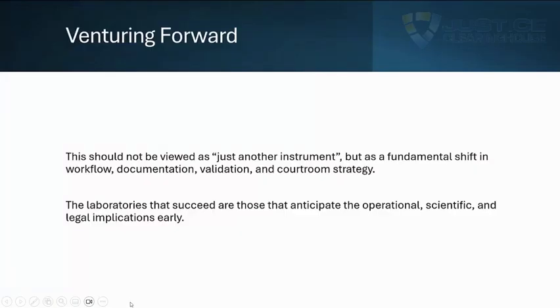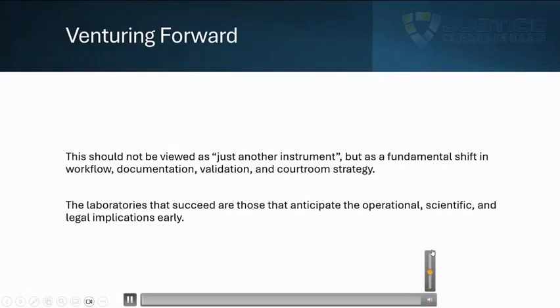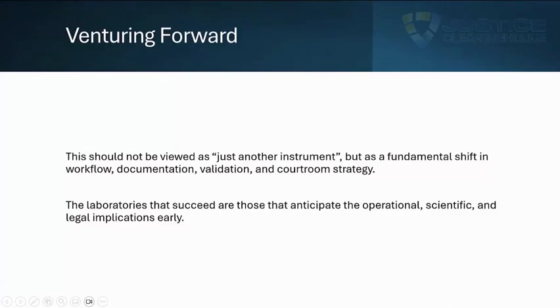All right, here's Ron again. It is important that this be viewed not as just another instrument, but as a fundamental shift in workflow, documentation, validation, and courtroom strategies. The laboratories that succeed are those that anticipate the operational, scientific, and legal implications of virtual comparison microscopy early.